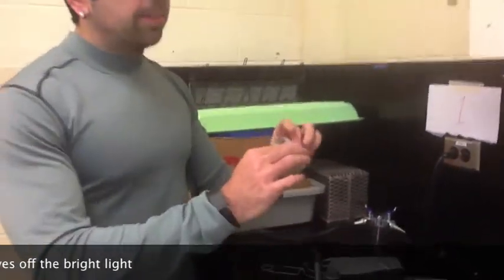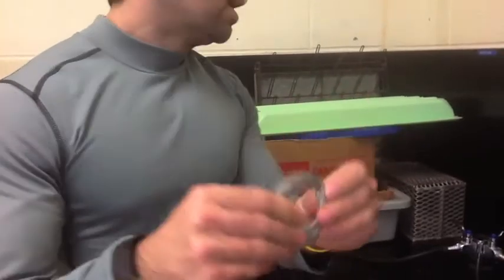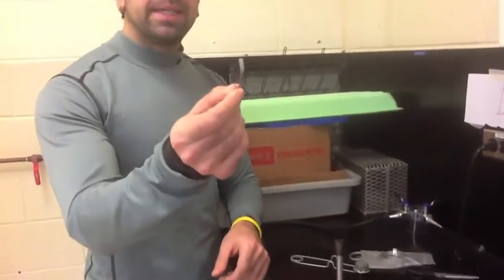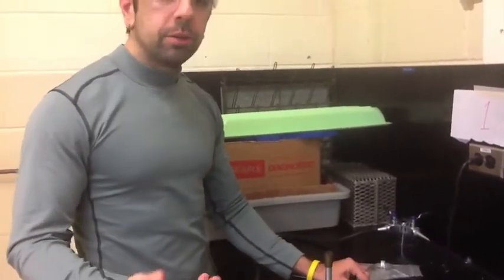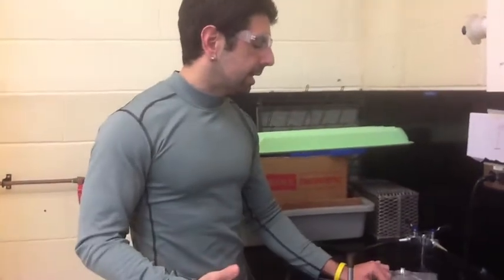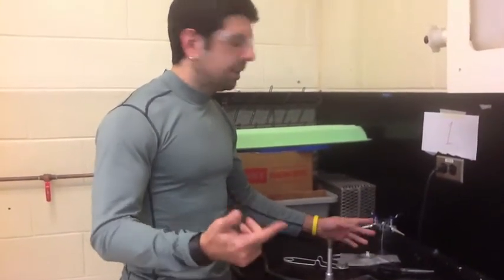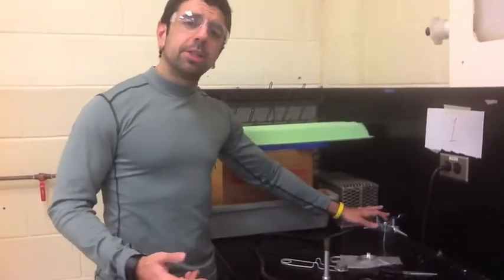Anyhow, this is what magnesium ribbon looks like. It's just coiled up. We're going to cut off just a little piece, just like that. I'm going to actually have it probably pre-cut for you. Just use one, please, because a lot of students love to try to burn through it. We're going to be using the Bunsen burner.